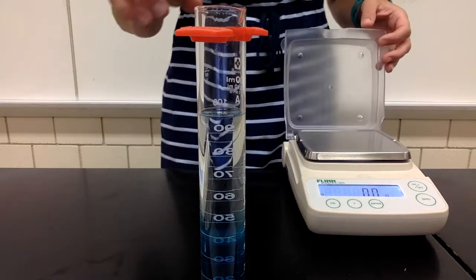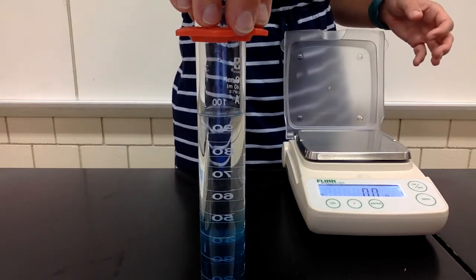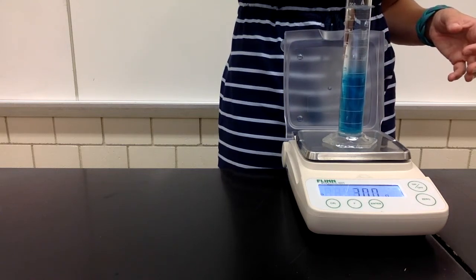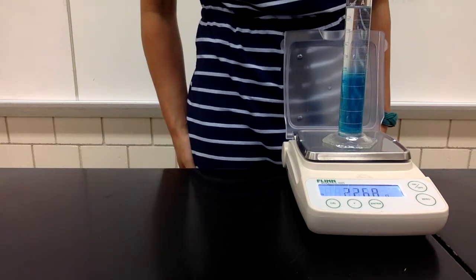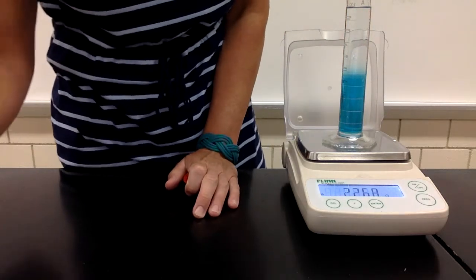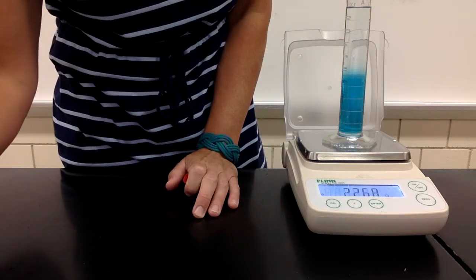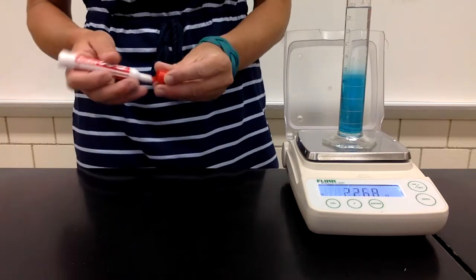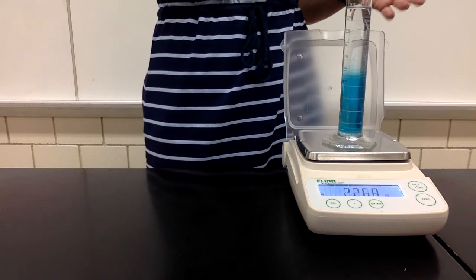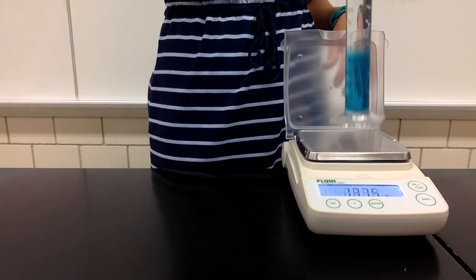And just to see if there's any change in mass after the mixing, I'm going to put this up here on the balance and get a reading, and I'll do this again after. 226.8 grams. So I have a reading for mass and for volume before the reaction, and temperature as well.